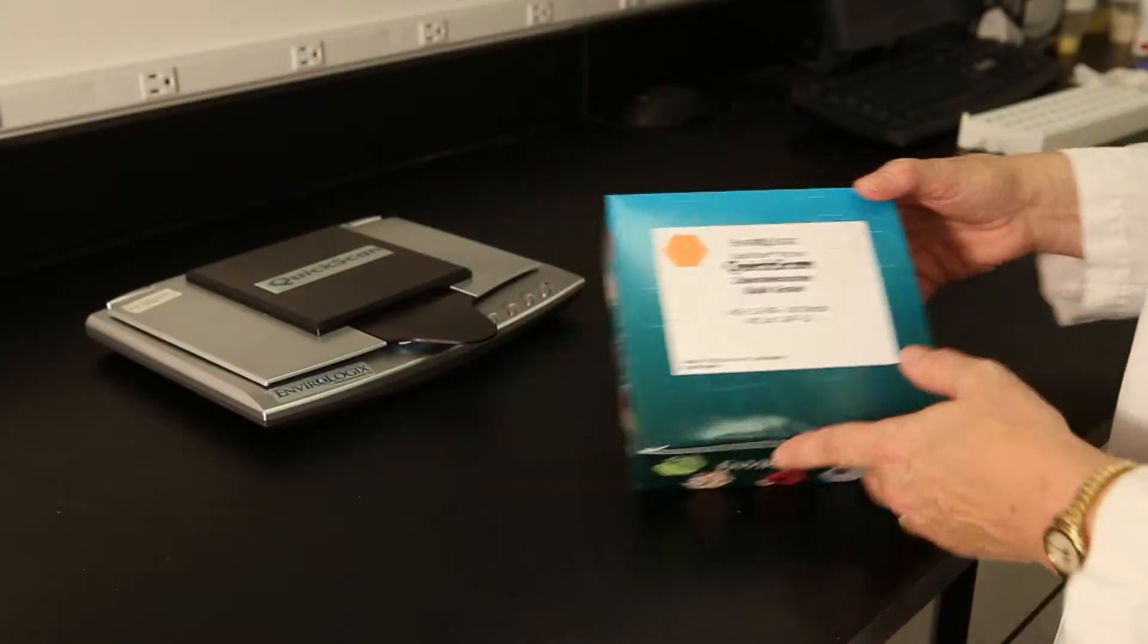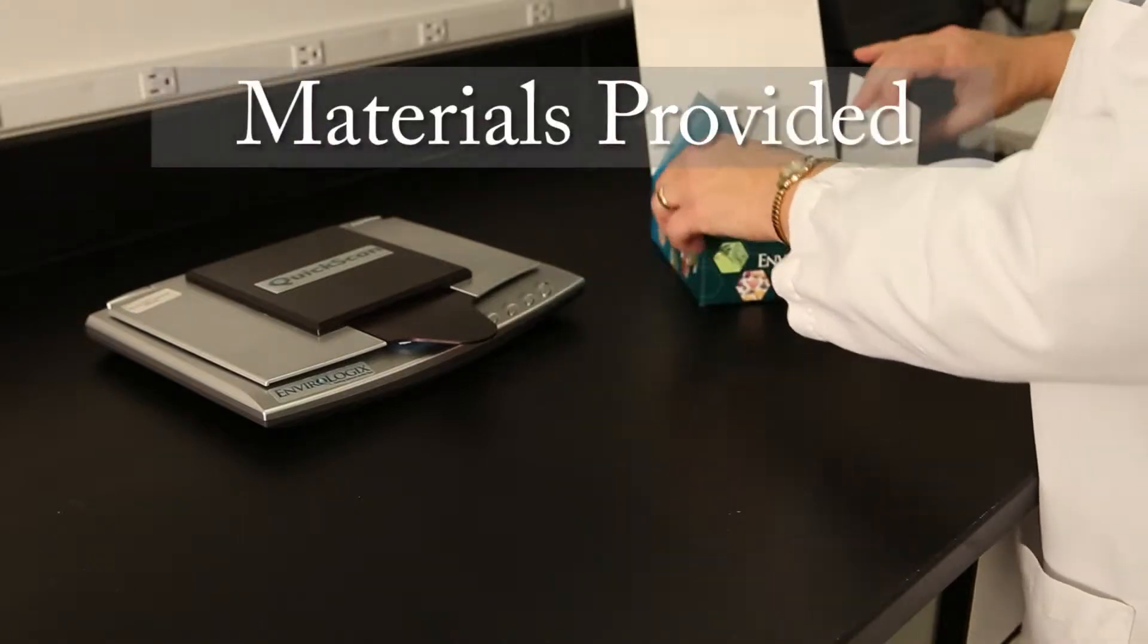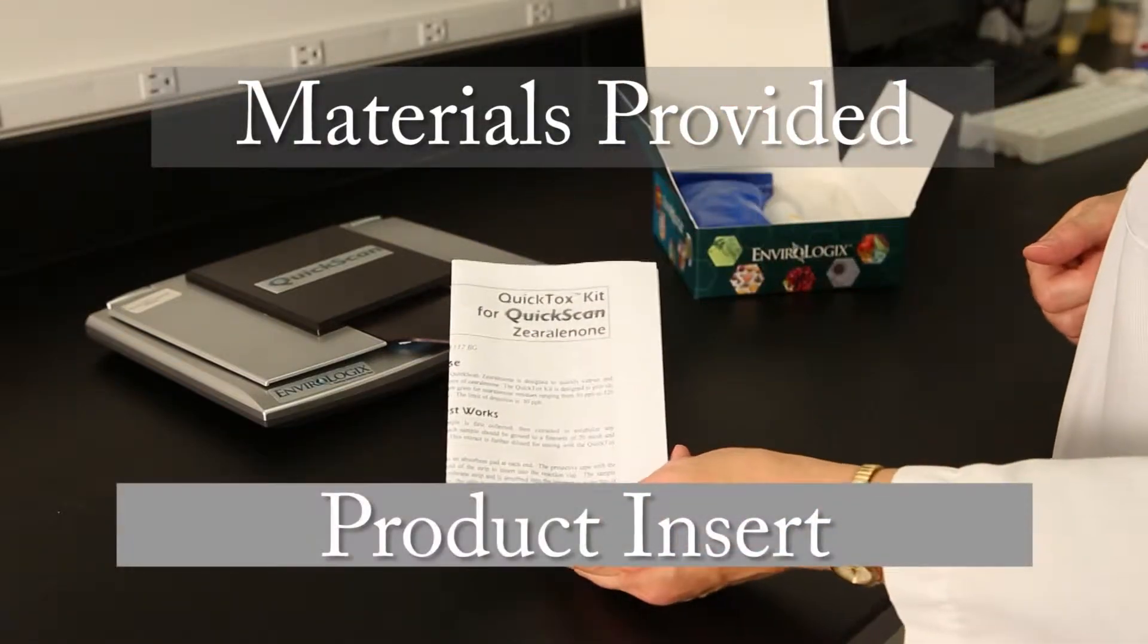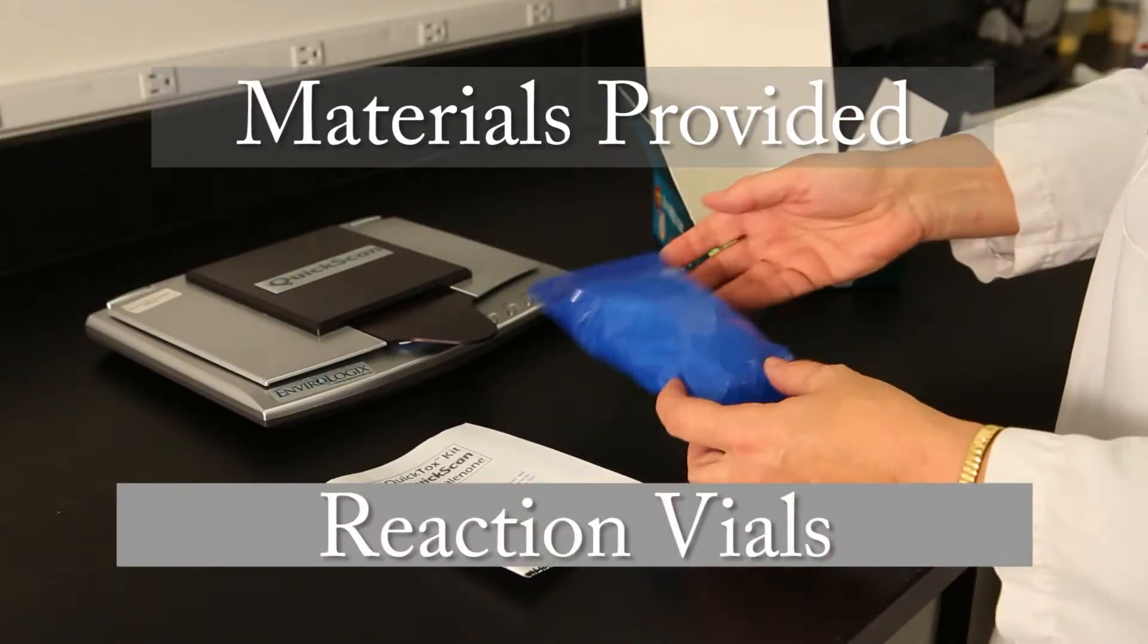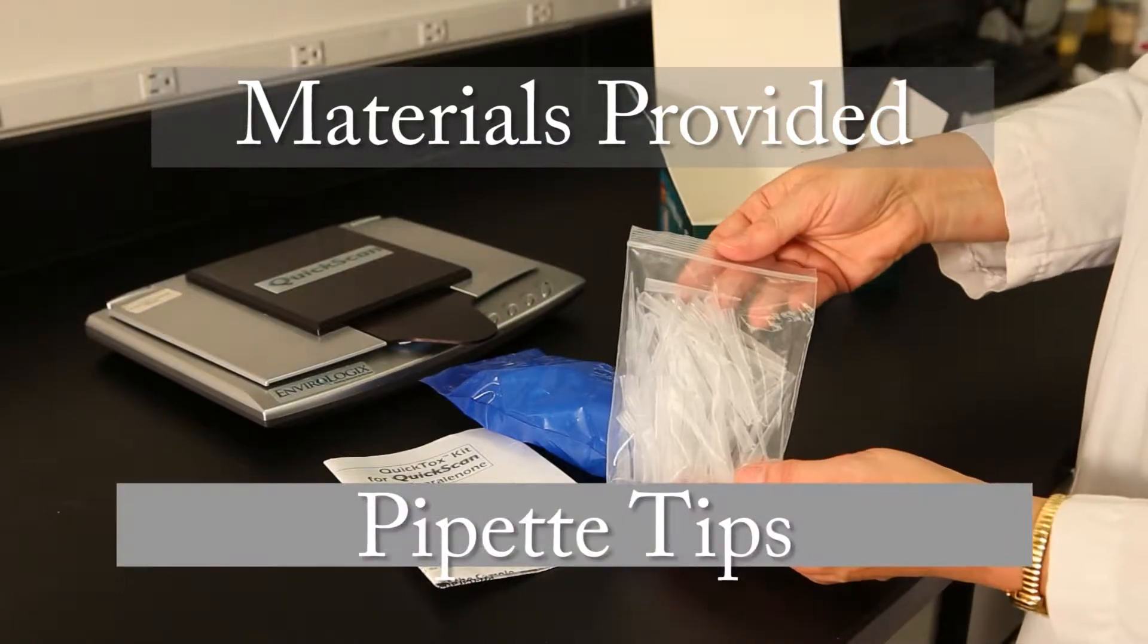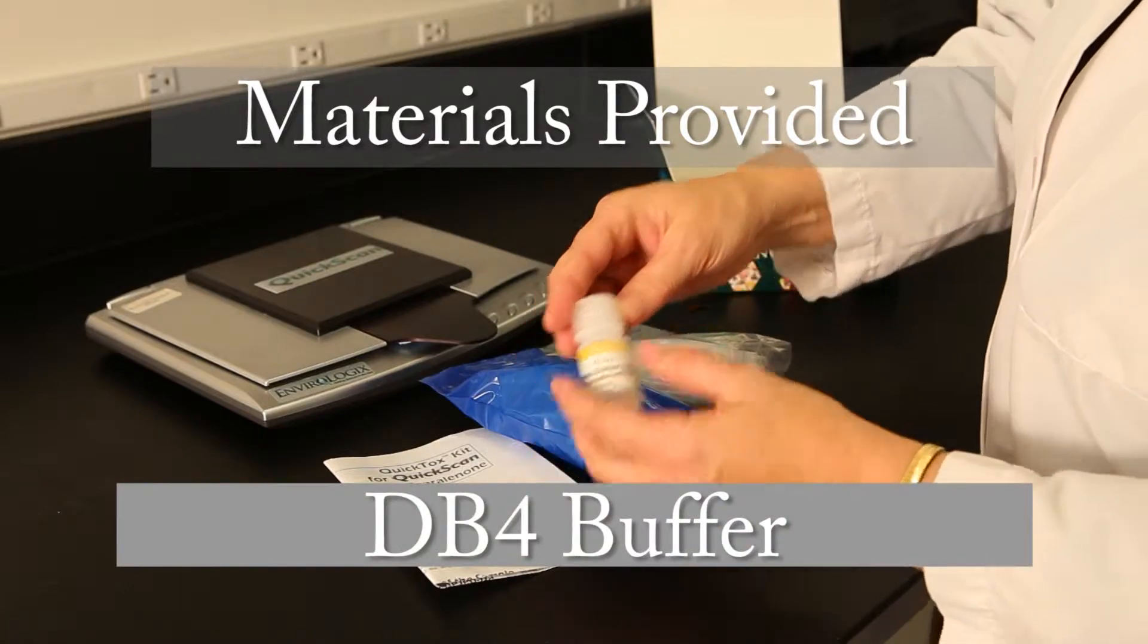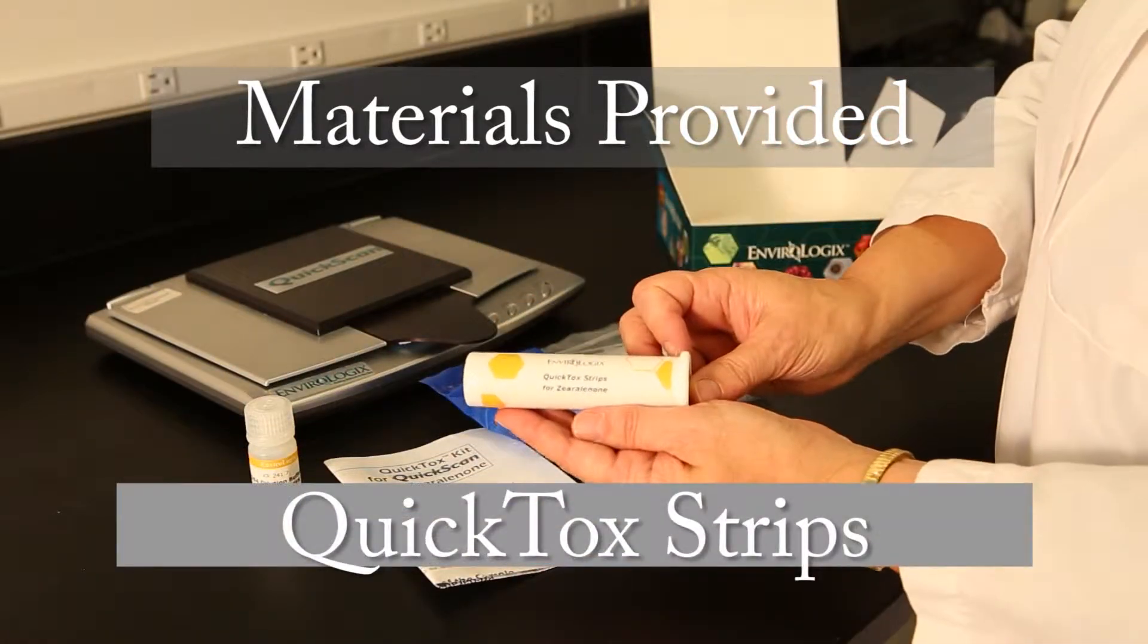When unpacking your QuickTox kit, please check to ensure all the components are present. Your kit should include a product insert, reaction vials, pipette tips, DB4 buffer, and QuickTox strips packed in a moisture-resistant canister.